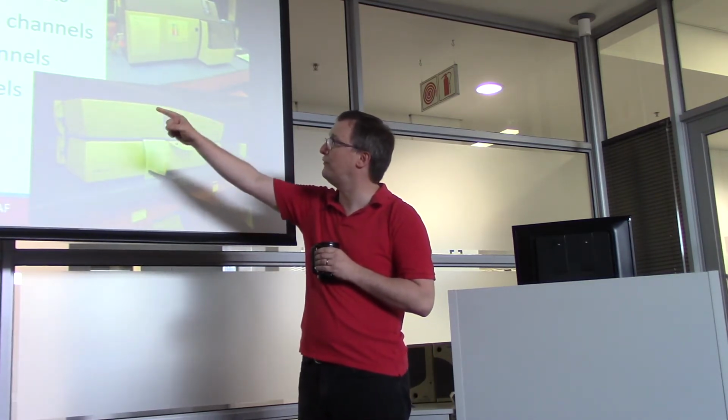I'm sorry. But I wanted to point out that we have 1, 2, 3, 4, 5, 6 different instruments that you can use. Some of them are very simple. If you're just trying to say, how many cells do I have per milliliter, that's a trivial kind of question to ask. If you're using fluorescence markers and you need to pack a whole bunch in there, that becomes a bit more complex, right? So this is the LSR2. This is currently our Cadillac. So you can measure 12 different colors of fluorescence on this instrument. That's pretty great if you're trying to pull out a very small subcell population out of a complex mixture. And that's good because I hang around with immunologists and I tell you they use this stuff.